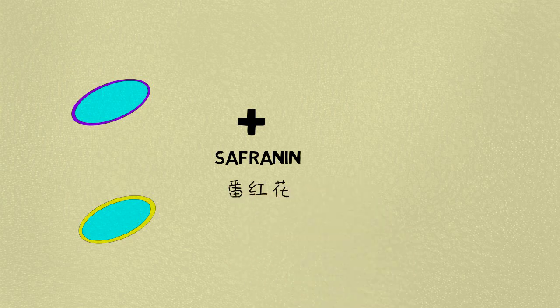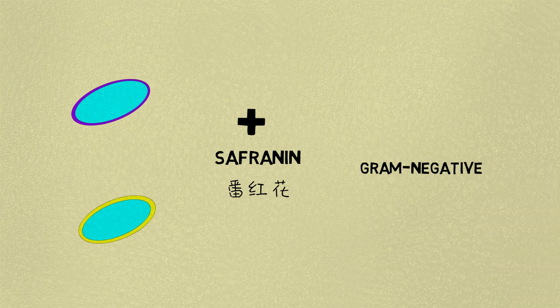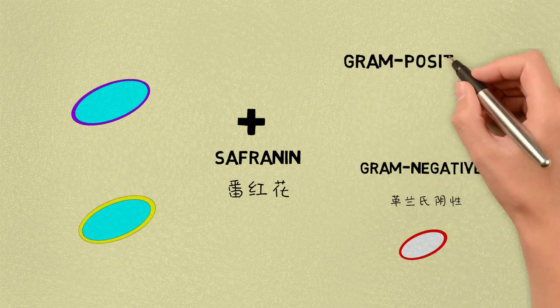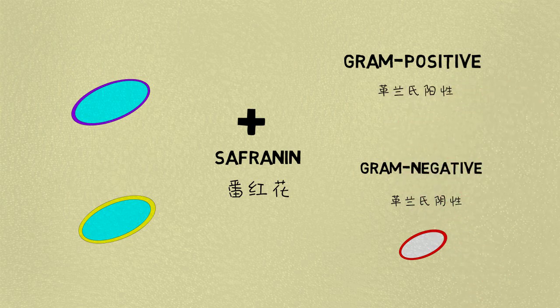After decolorization, the gram-positive cell remains purple and the gram-negative cell loses its purple color. Counterstain, which is usually positively charged safranine or basic fuchsin, is applied last to give decolorized gram-negative bacteria a pink or red color. Both gram-positive bacteria and gram-negative bacteria pick up the counterstain. The counterstain, however, is unseen on gram-positive bacteria because of the darker crystal violet stain.